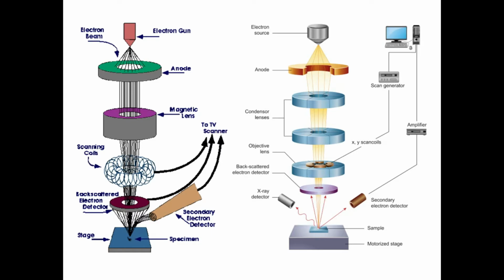Okay, for instance, Everhart-Thornley detectors are registered. It's for secondary electrons, and this will give the electrons dislodged from the outer surface of the specimen. These detectors are capable of producing the most detailed images of the surface of the object. Okay, other detectors you can also get, such as backscattered electron detectors and X-ray detectors, also used to get additional details. Depending upon your research work, you can use whichever one you want. Okay, that is the one we are using.